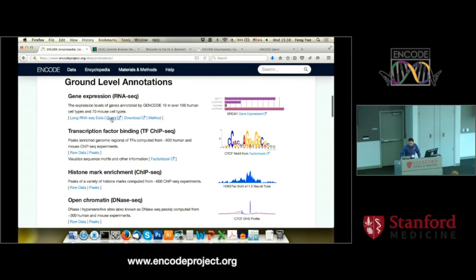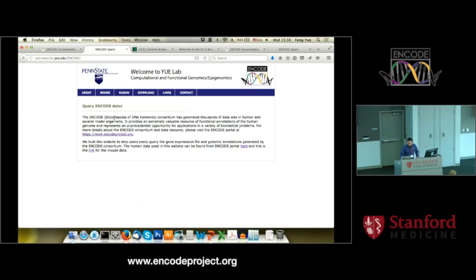Everybody just feel free to do it — unless it's getting really slow on my computer, I may ask you to stop. But for now, we are still friends. Click query, and it will bring you to this wonderful website. Of course, it's developed in my group. Click human.